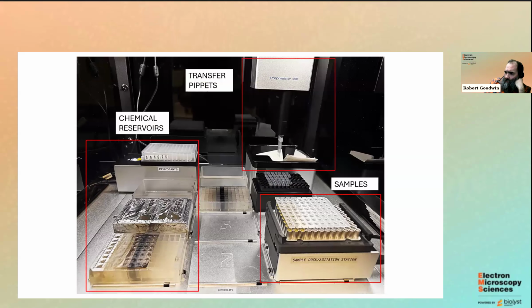This is just our layout. So this deck is extremely customizable, whether you select which sample or which pieces of equipment you want to have in there, which ones you want to use, where the chemicals are taken from. In the sample section, we mainly use the 96 well PCR plates.